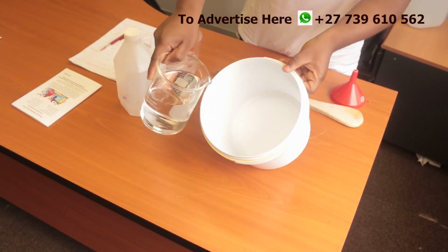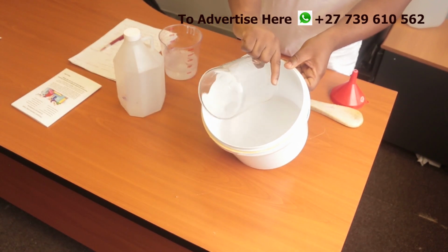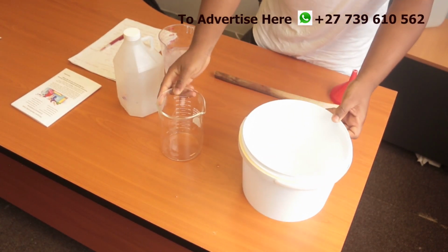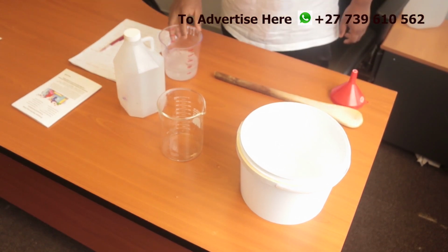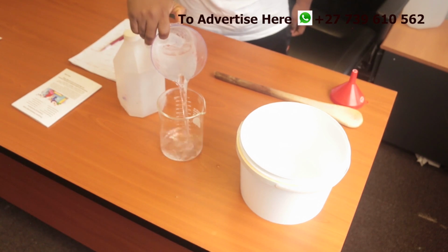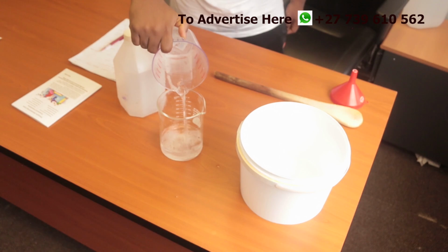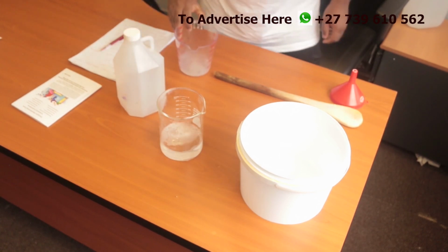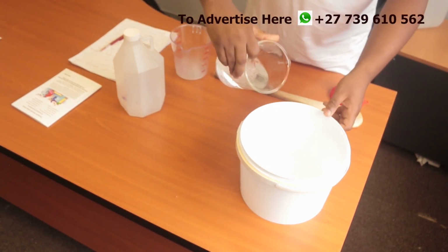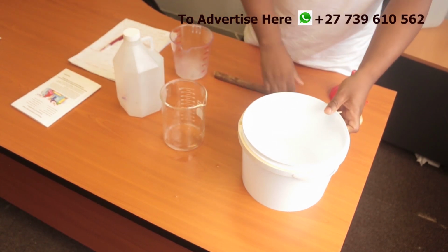Wear your gloves and glasses just to protect yourself. Then you need 263 ml of water. That's what I'm measuring now. Do your mixing properly.